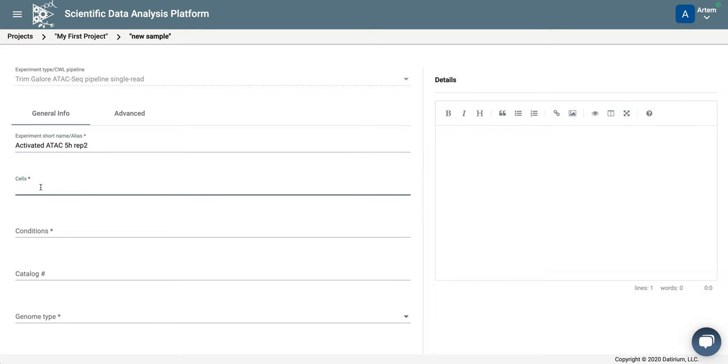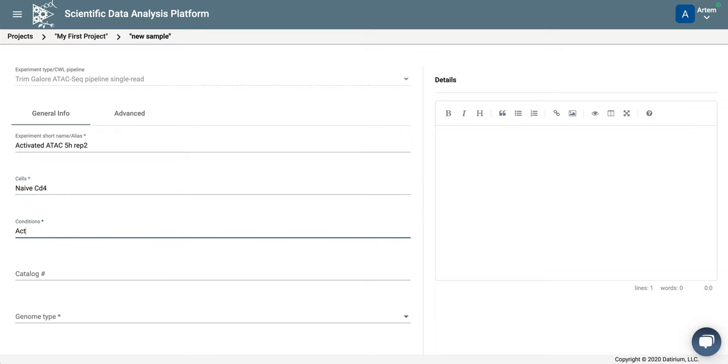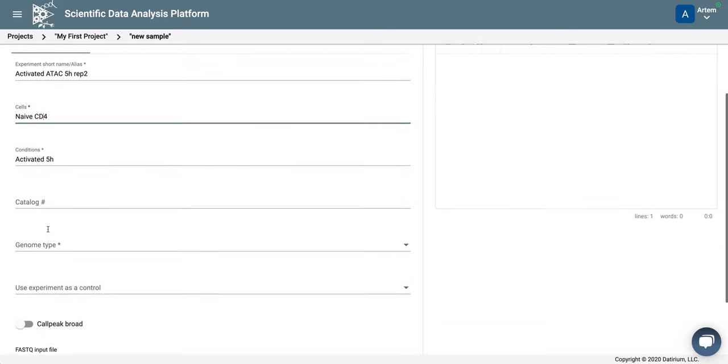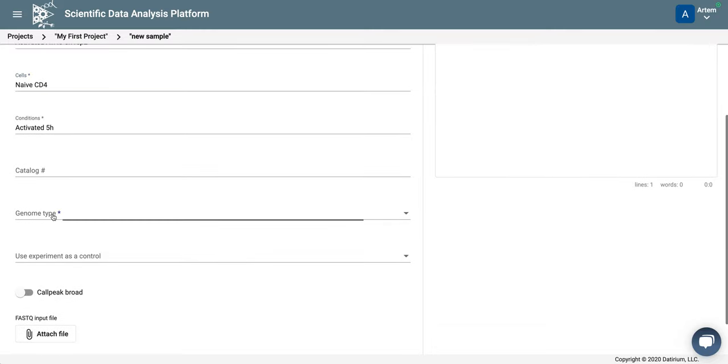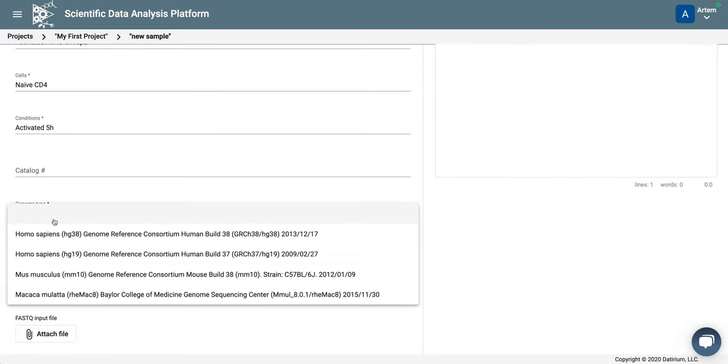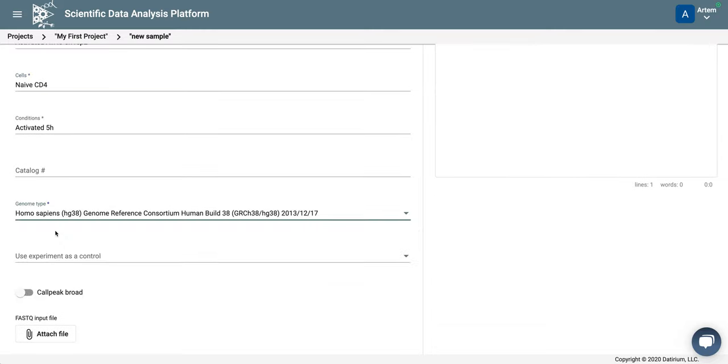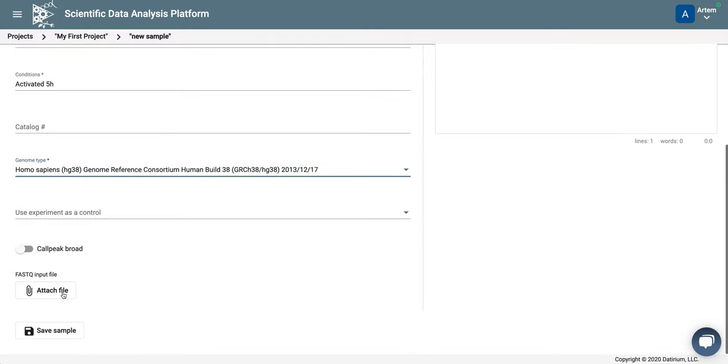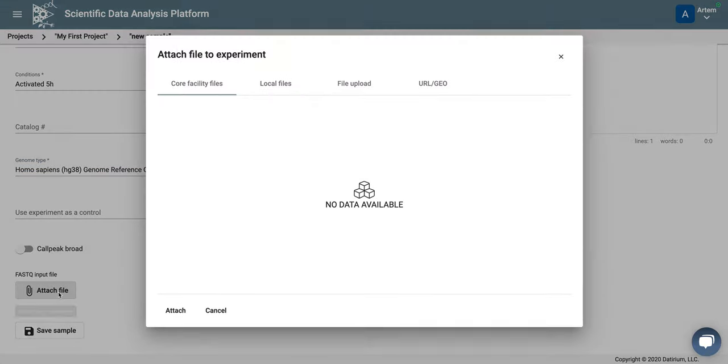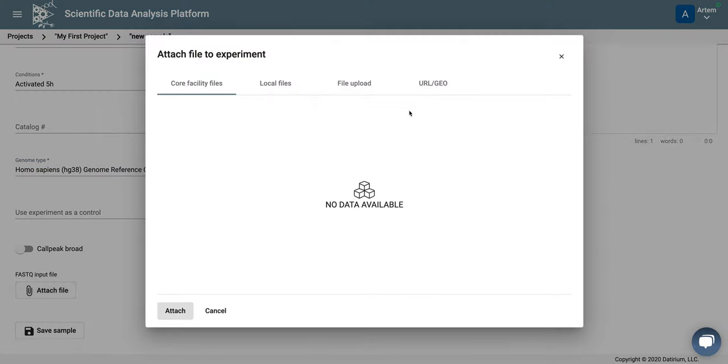Cells are naive CD4 cells that were activated for 5 hours. We don't need catalog number, so for genome, again, we use the latest human genome, and then we need to attach the data.